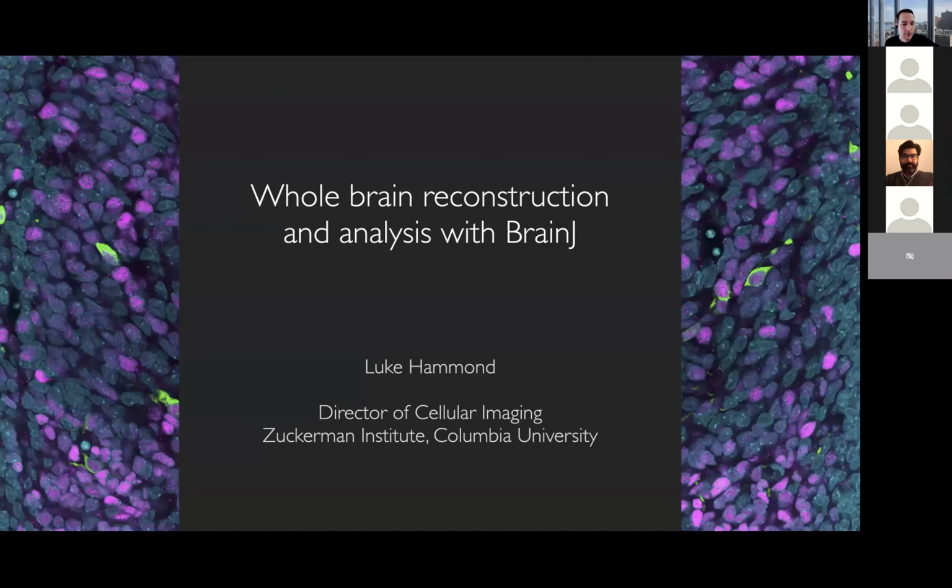The whole idea of these workshops and tutorials is to give you a good idea of how to use freely available tools, as well as some of the tools we've developed inside the platform. And the first three are really to do with brain analysis and visualization. So we went through ClearMap last week, and this week we're going to look at how to use BrainJ for things like confocal images and images from the slide scanner.